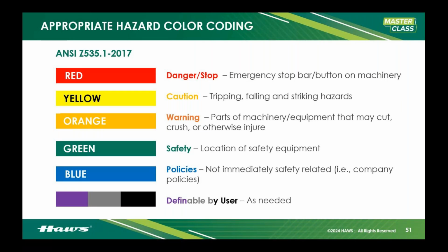Make sure you are color coding your emergency equipment, whether it's ours or not. Ours come green as green for safety. It's really important. Blue is policies, and then purple, gray, and black. You can make those whatever you want in your facility.